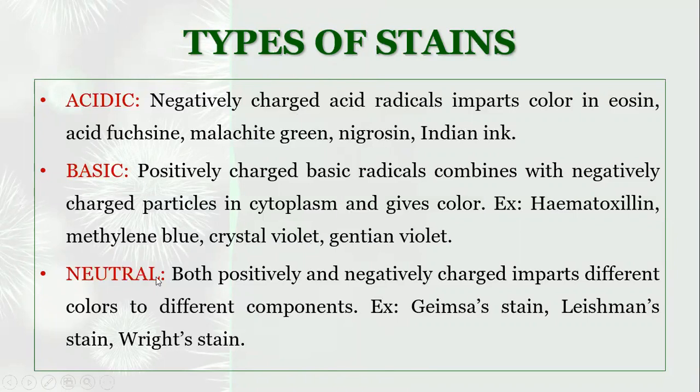Next, neutral dyes. Neutral dyes are both positively and negatively charged, and they impart different colors to different cell components. Examples of neutral dyes are Giemsa stain, Leishman stain, Wright stain, etc.